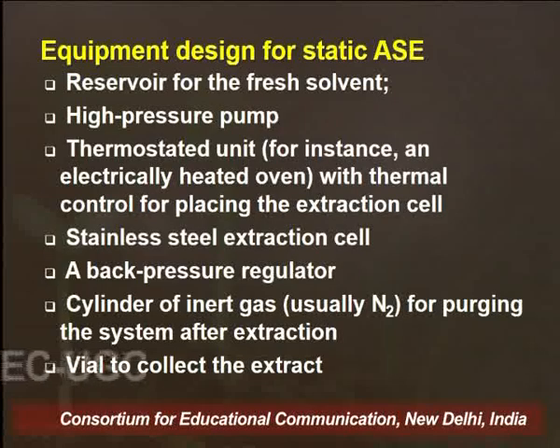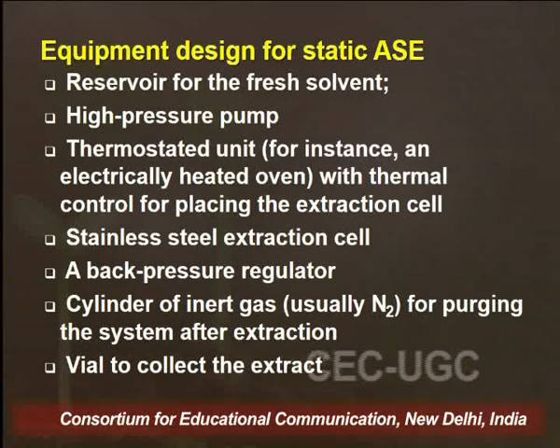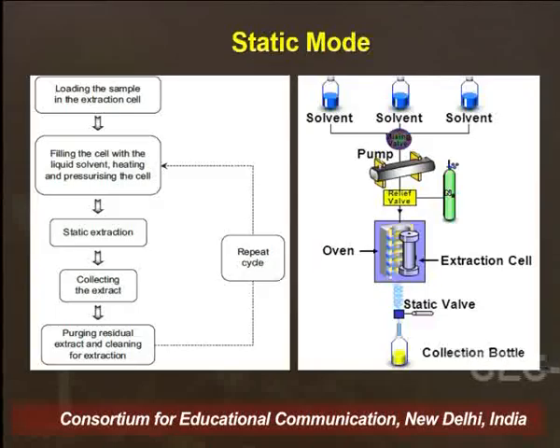Now if we go into the equipment design for the static ASE, I'll just take you back to the picture. So what happens is, once this pump pumps the solvents into the extraction cell which is already filled with the sample, this extraction cell is then subjected to the prescribed temperature and pressure conditions, and the static valve, as I told you, remains closed.